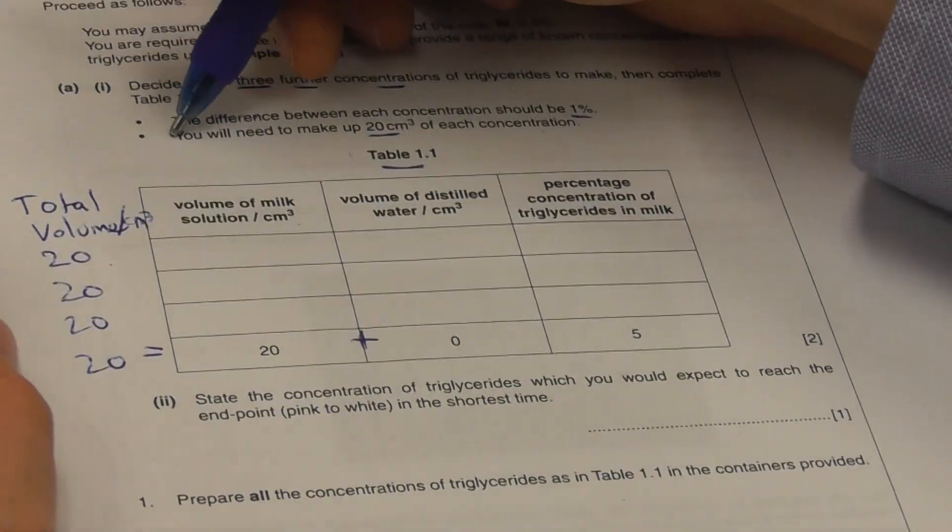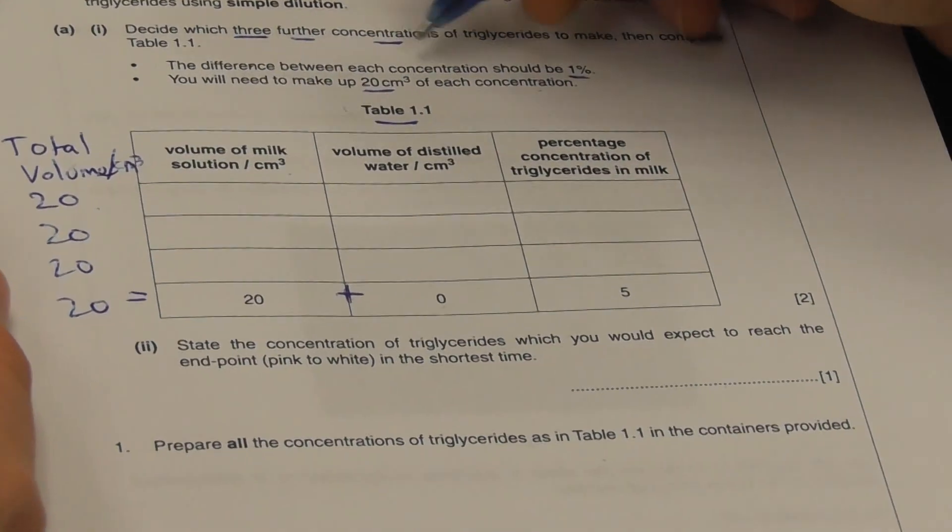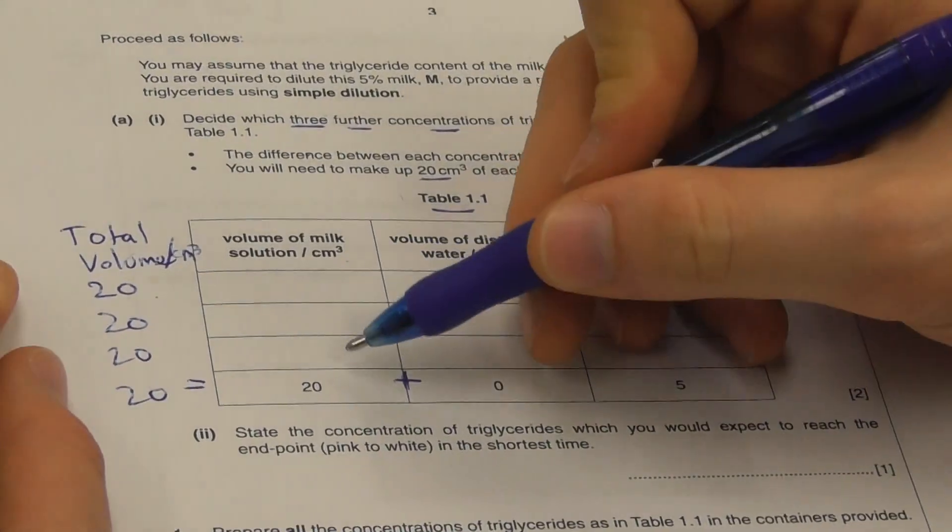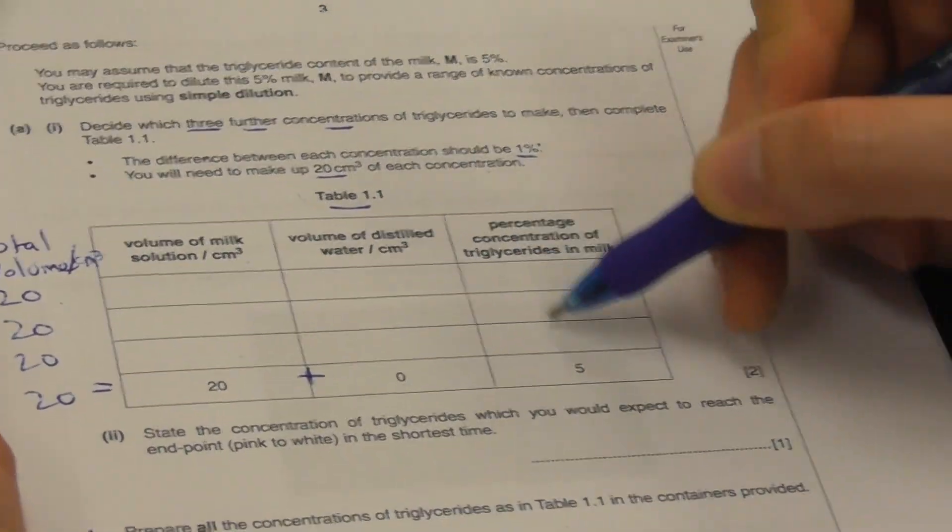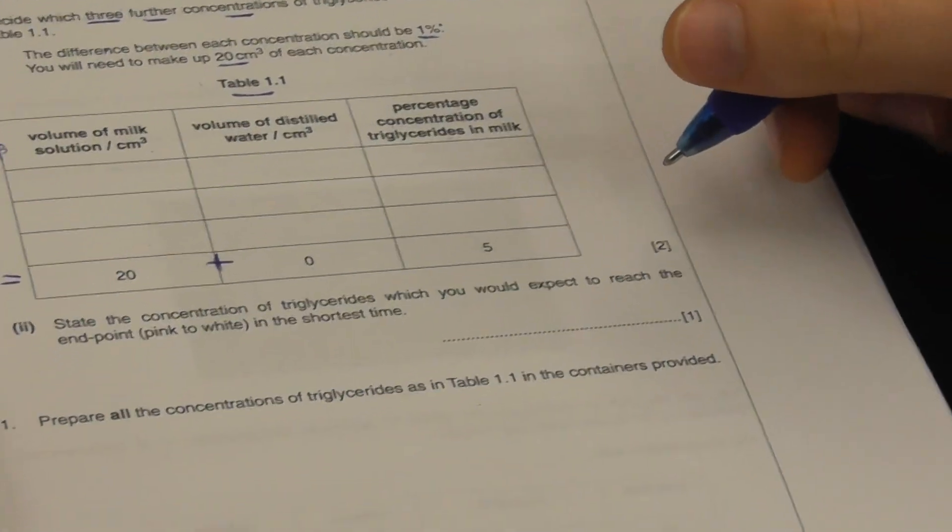So that jives with this. The difference between each of our concentrations should be 1%. And we're going to make 3 further concentrations.